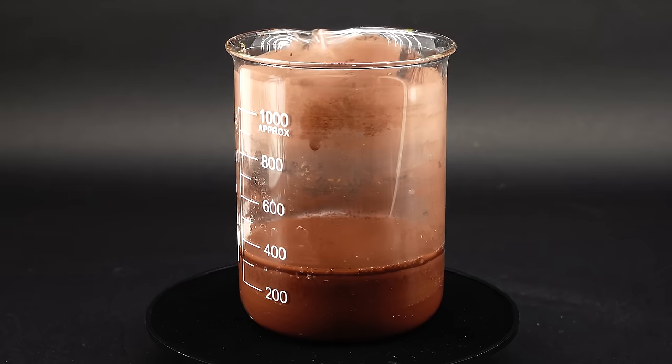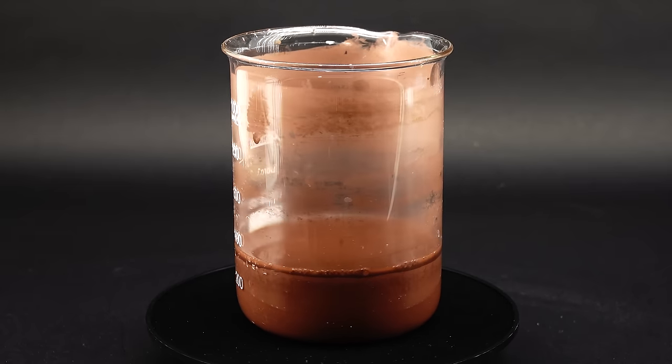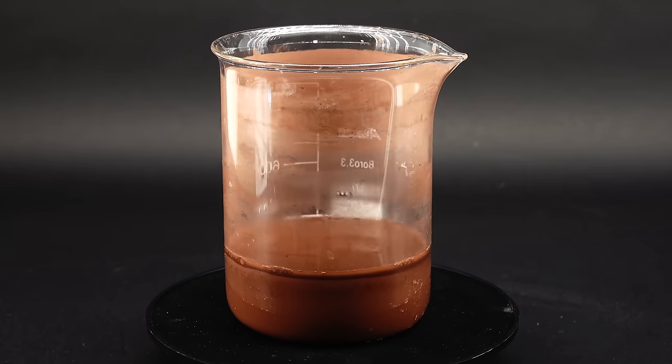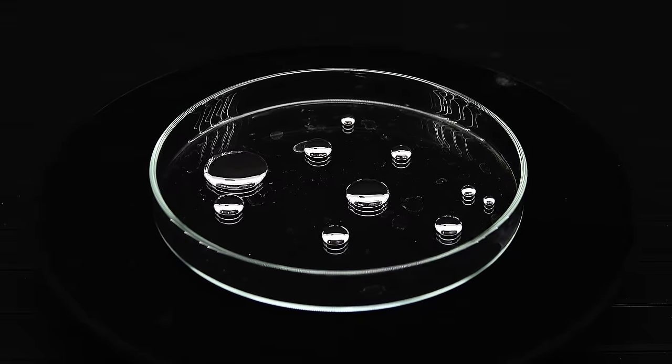Anyway, now with the powder ready, I can finally start making the amalgam. To do that, I will just have to combine my beautiful copper powder with some mercury, which on paper doesn't sound all too hard.